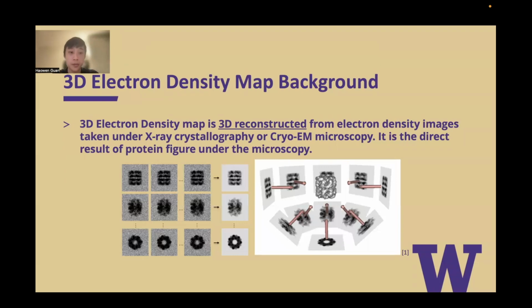Since our research group mainly focuses on cryo-EM microscopy, from now on, by saying electron density map, I'm mostly referring to cryo-EM density maps. However, X-ray crystallography density maps are very similar, so our approach generalizes well to both.